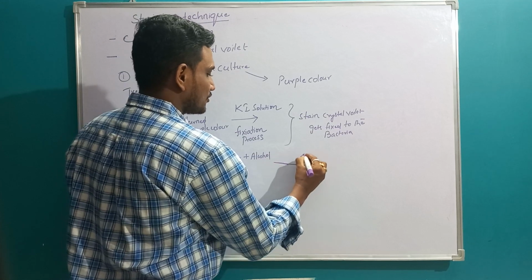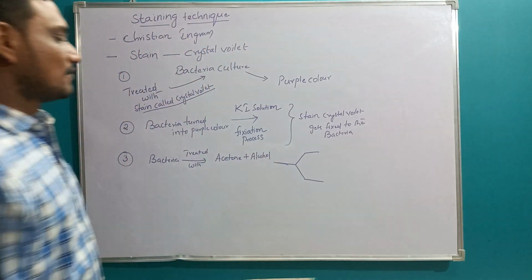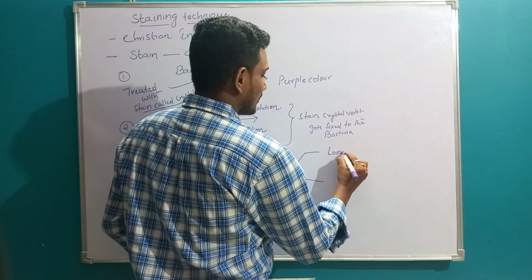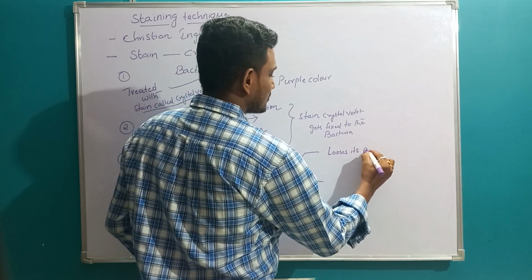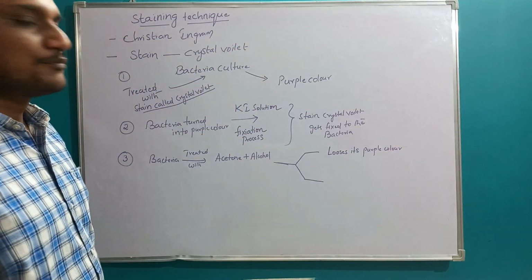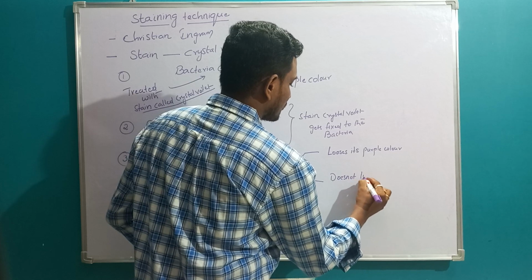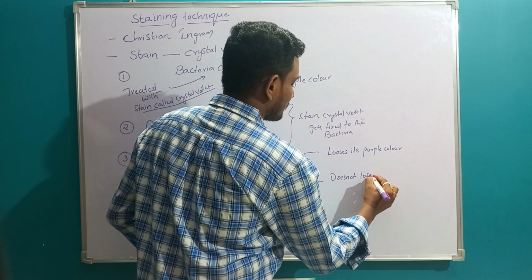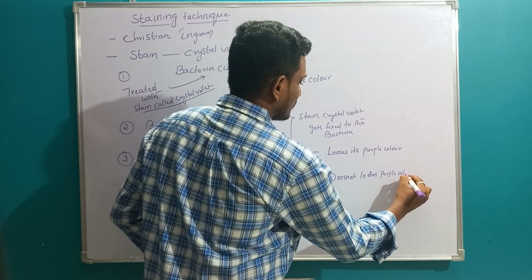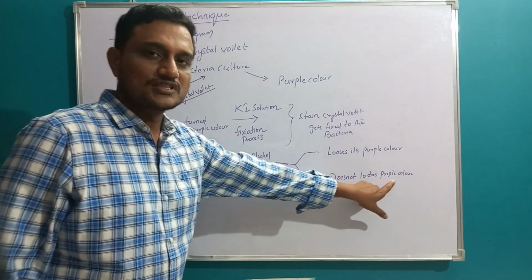Some of the bacteria lose their purple color, and some do not lose the purple color.